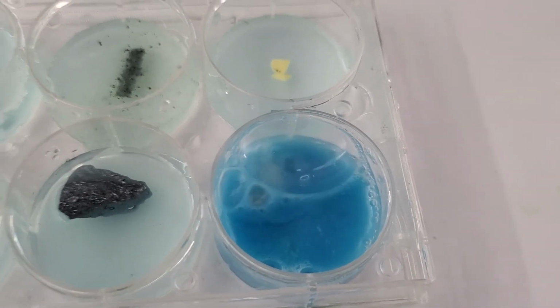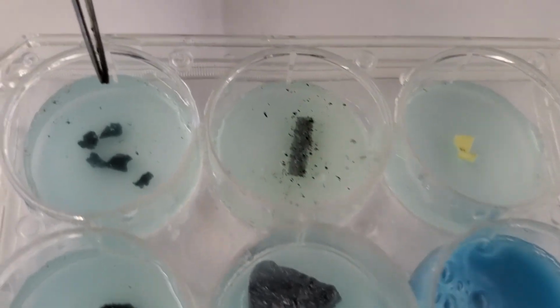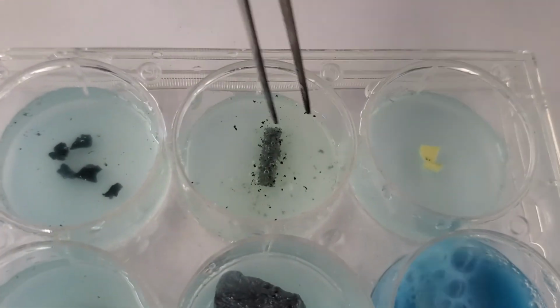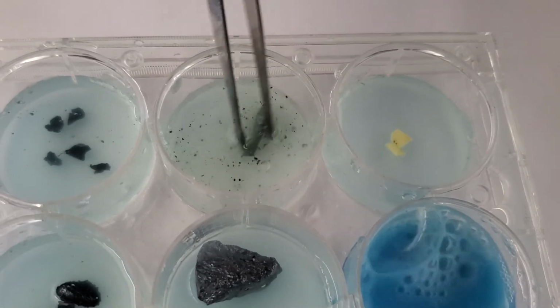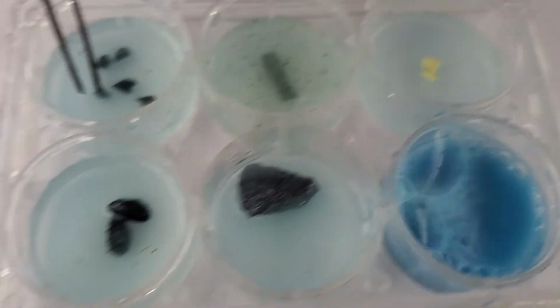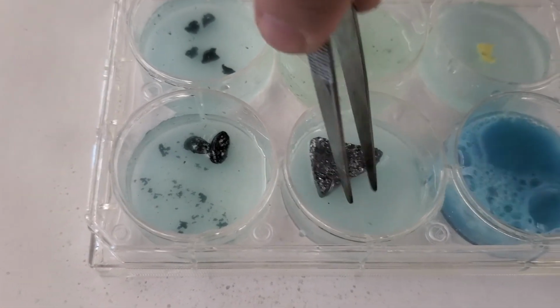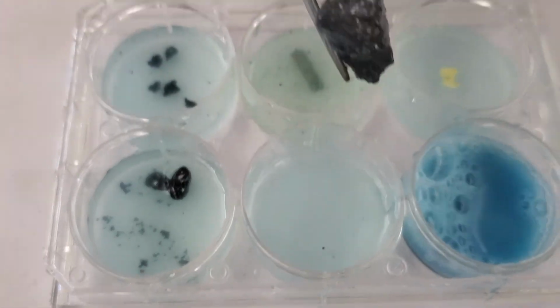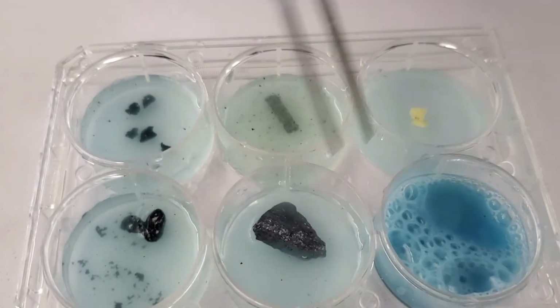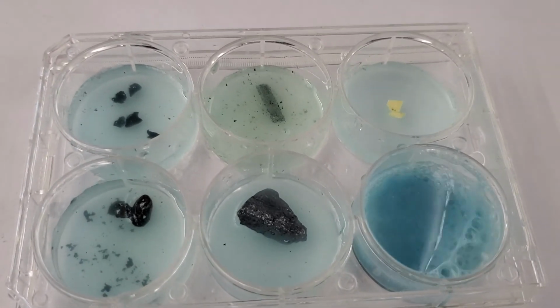Now let's go back and look at the rest of them. We'll come back and look at all of them so you can see what's happened with the carbon. You can see there's more powder that's come off the magnesium. You can see the sulfur. You can see the zinc. And the silicon, and then lastly, definitely still active over there with the calcium.